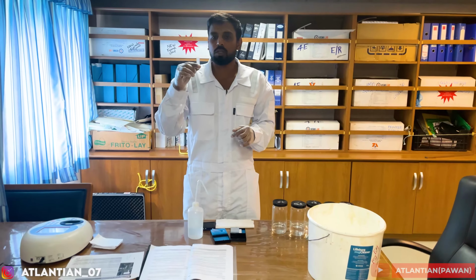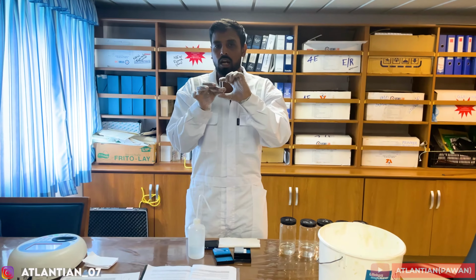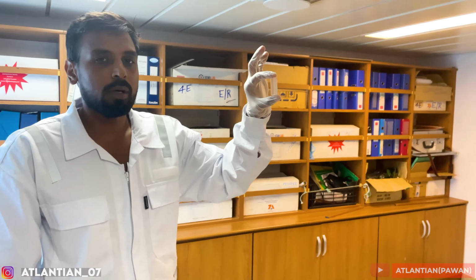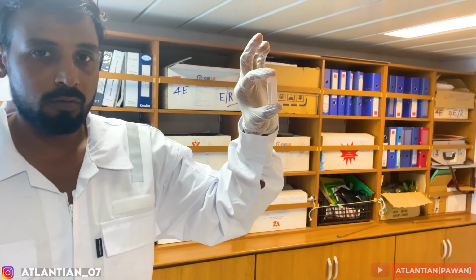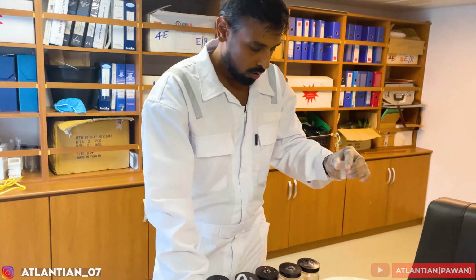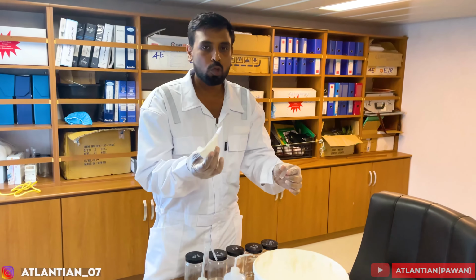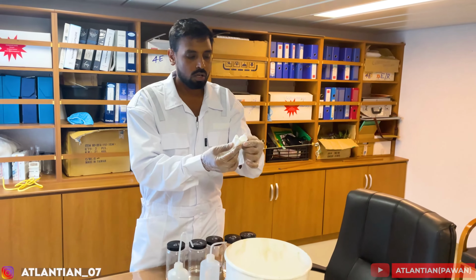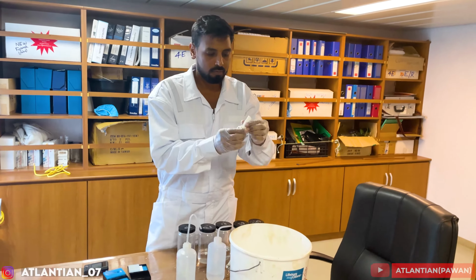This UV transmission we'll be doing in a special cell which is made of quartz glass. These glasses are not visible in UV scanning, so that's why we are using them. This is given with the spectrometer itself. First I'll wash it with methanol. If you have tissue paper, you can wipe it with tissue paper, or if you have a cotton cloth, that's much better.